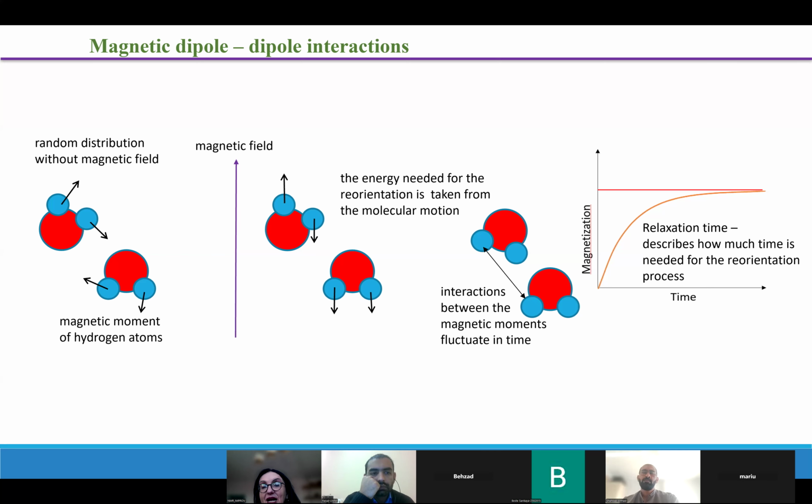This is what we discussed a moment ago, yeah? If I hypothetically focus only on two molecules, then the molecules will change relative orientation, will change distance, because everyone moves completely stochastically.